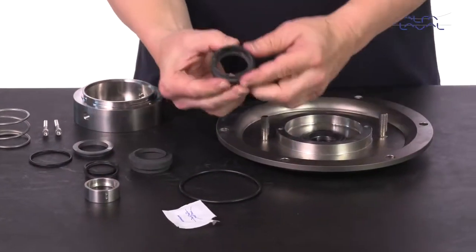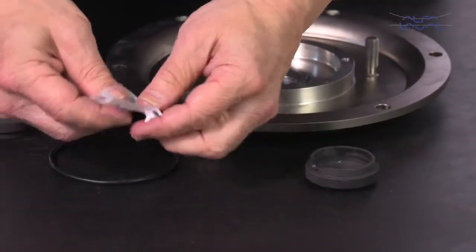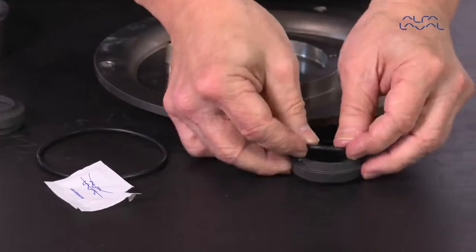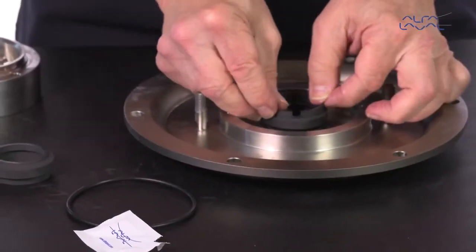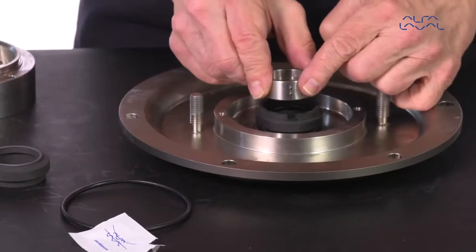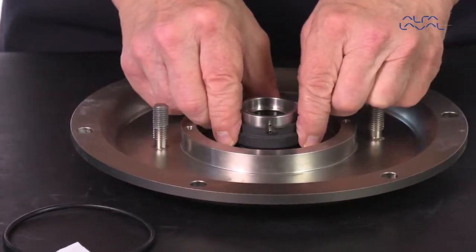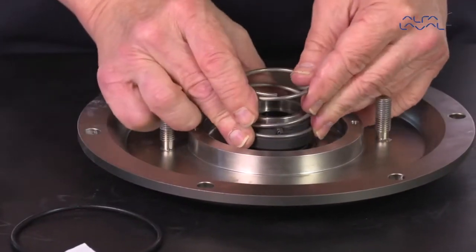Lubricate the o-ring and place it in the rotating seal. Place this onto the seal face of the stationary seal and fit the drive ring into the rotating seal. Place the spring on the seal.